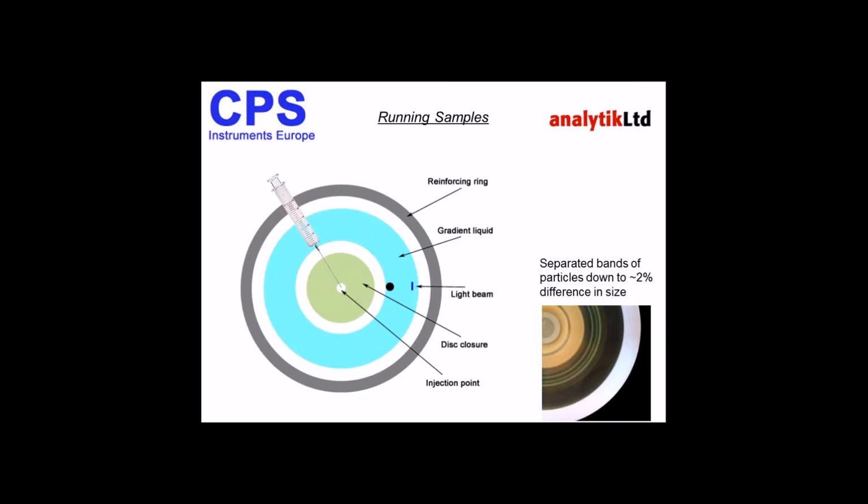When the analysis is complete, the sample will remain on the outer edge because the disc is moving. So you can then inject your next sample without worrying about any contamination from the previous sample.